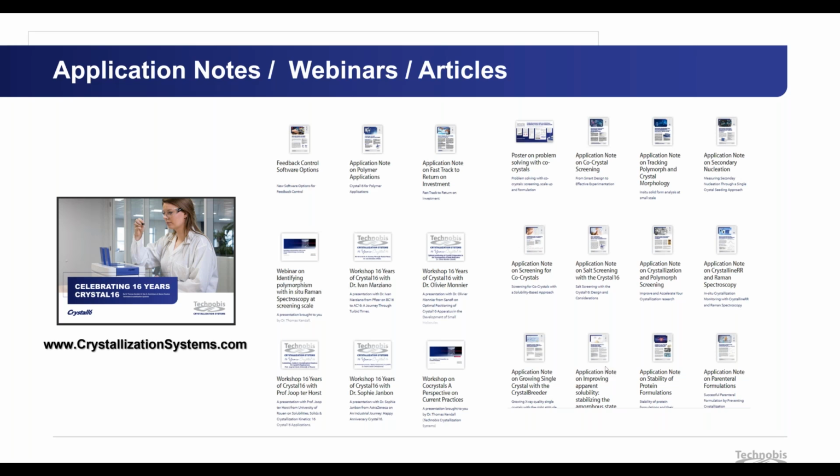If you would like to, for example, get the most thermodynamically stable form, of course you would slurry, or competitive slurries, for example. I didn't mention this during my presentation. If you have two different forms and you are not very sure about their stability at a certain temperature in certain conditions, competitive slurry is a good way to go further with that.